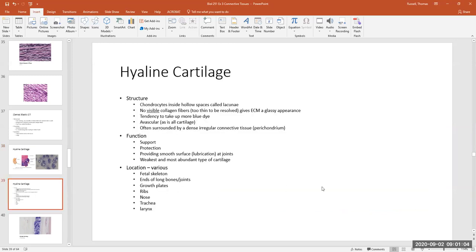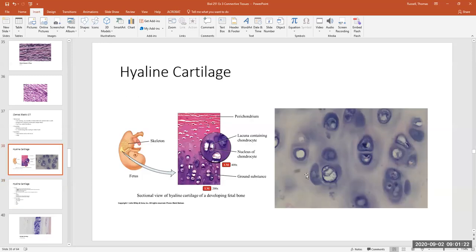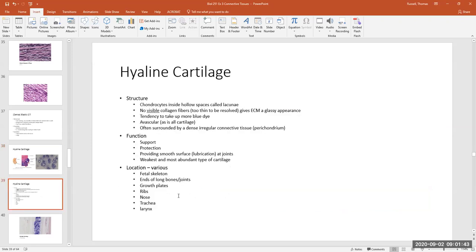Looking at specifics about hyaline cartilage: the chondrocytes live in holes called lacunae. Typically in hyaline cartilage you don't see the collagen fibers too much, which is why it takes on a more smooth or glassy appearance — that's an identifying characteristic. It takes on a pinkish to bluish stain. This tissue, and all cartilage for that matter, is avascular.